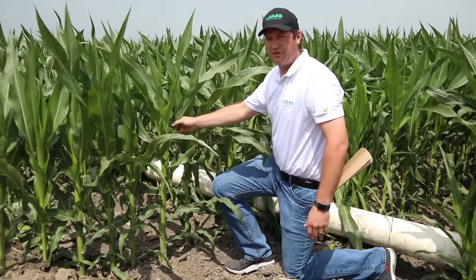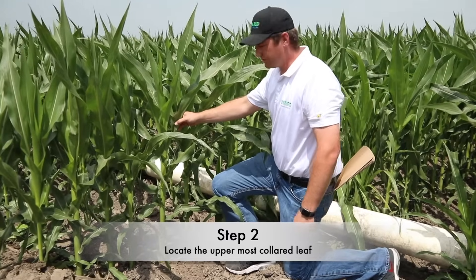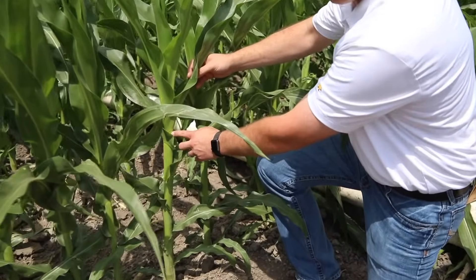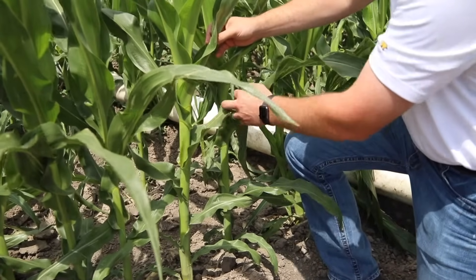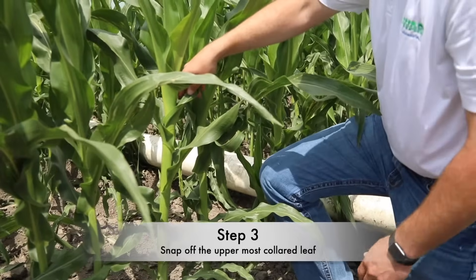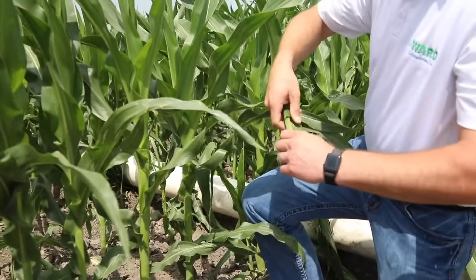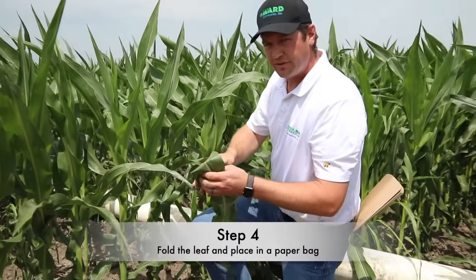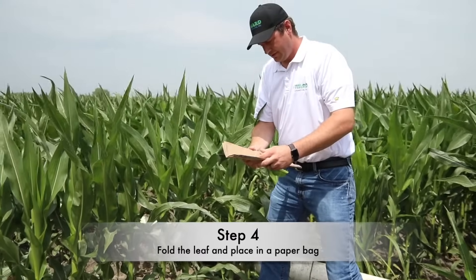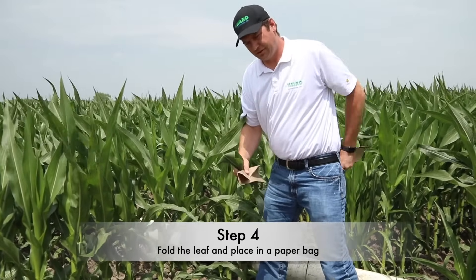When we're taking the tissue sample, we want to go ahead and sample the uppermost collared leaf. So we're looking for the visible collar — we can see the visible collar right here on the plant. As we take the sample, there's no need to cut or anything; we just want to take the leaf and simply snap it off. So then we have our leaf here, and we're going to fold it in half and place it in our sample bag.